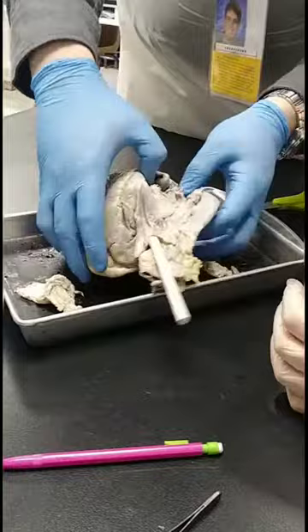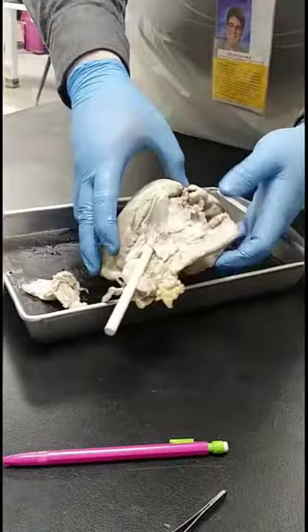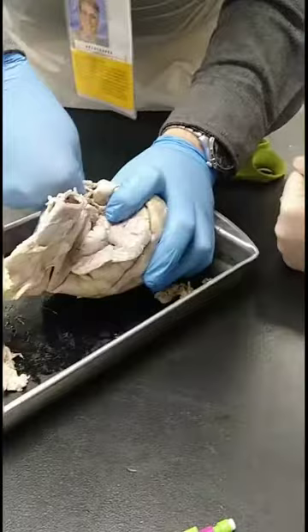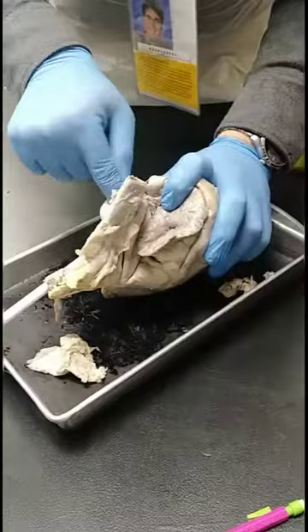Okay. This is your anterior side. Your posterior side is here. What we're looking for is kind of buried in there. You see this? How thin it is? This is one of the vena cavae. Well, the cavae, that's a plural. So, this is the vena cavae going into the pig heart.